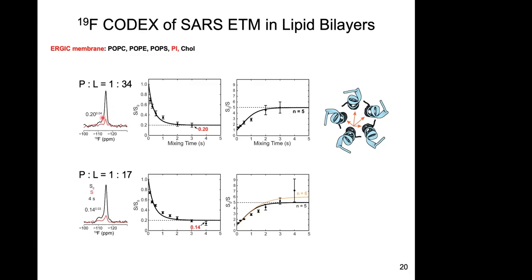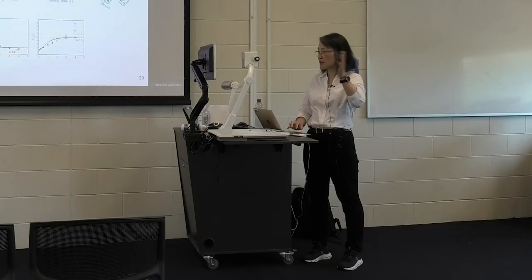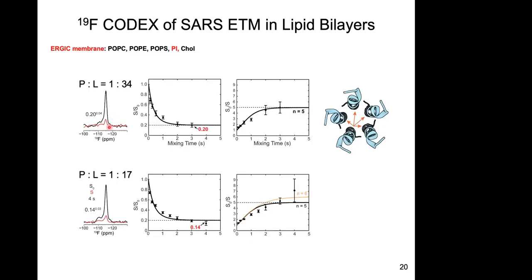And then I flip, the TM is the long one first and then the short one next. That's my dephasing. And you see that I can take examples where I went out, I think maybe 3 seconds. Basically, when you wait long enough, you can see how the dephasing experiment shown in red is so much lower than the control one.